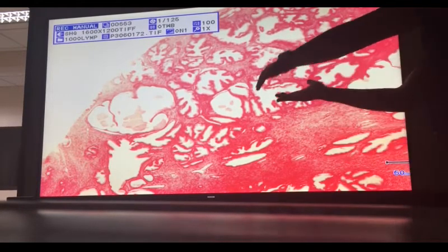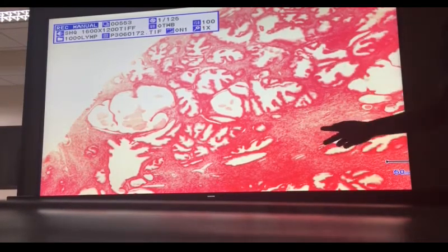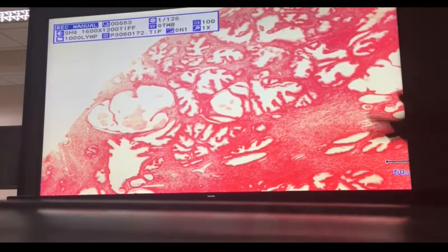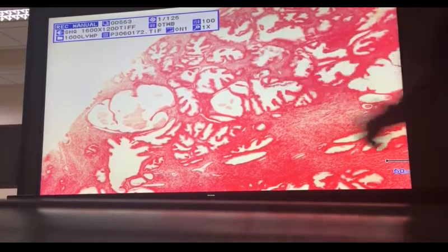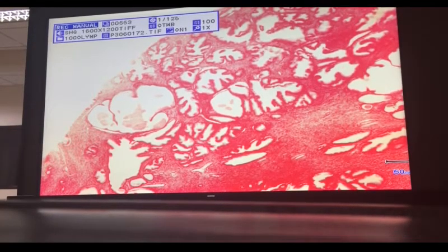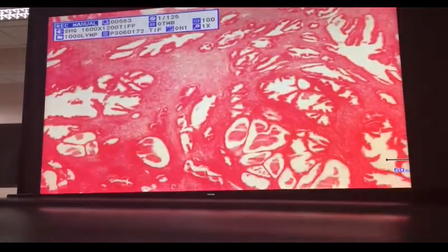You have the acini, the secretory portion, and the fibromuscular stroma because of the presence of numerous smooth muscles. Now, the smooth muscles will also contract during ejaculation to squeeze out the secretions of the prostate gland. What sugar, fructose, is coming from what gland? Seminal vesicle.